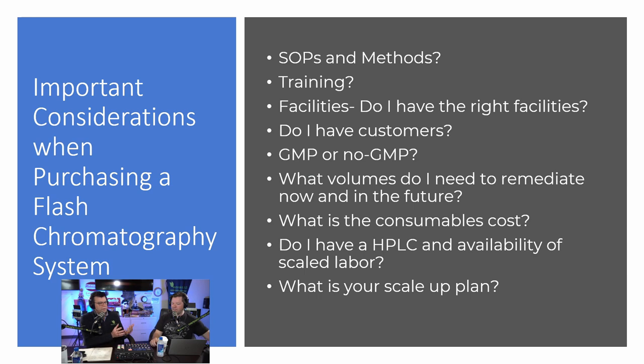Would it be better to remediate out the THC first? Maybe you could do that, perhaps, unless the CBC and the THC co-eluted. Which they do, because sometimes, CBC, maybe they do, maybe they don't. I don't know exactly if they do or not. Well, I work by rumor. I'm not a scientist. I have heard that that is the case. It depends on the column. It depends on the whatever. So you have to specify those conditions in order to really know.